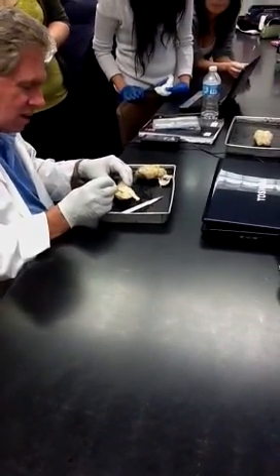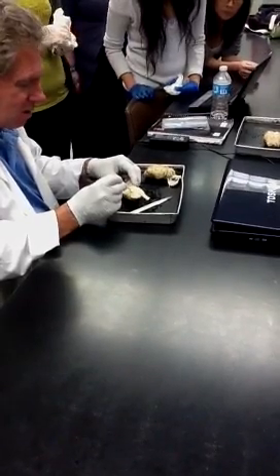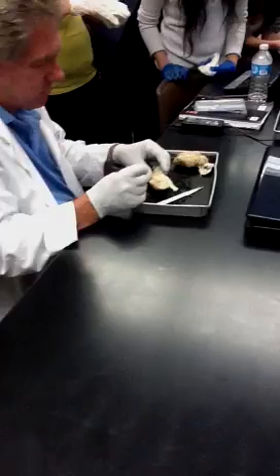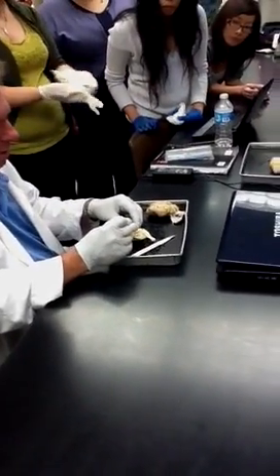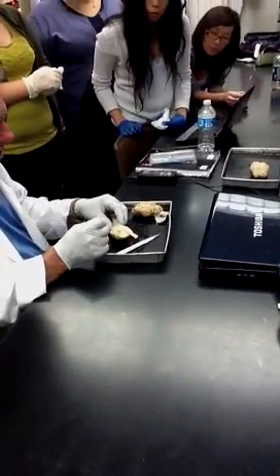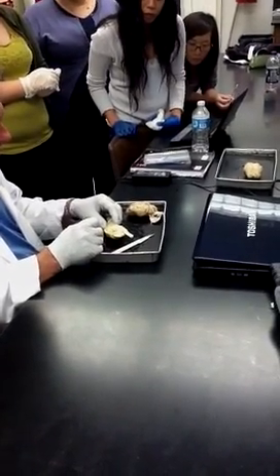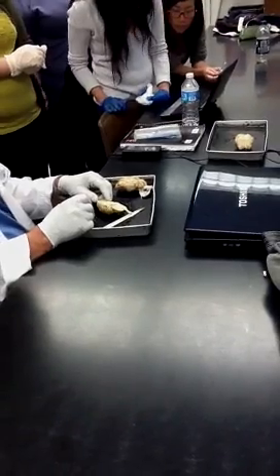The pineal gland isn't cut well on this one. It's kind of cut off. It used to be right there. It's disappeared, but it used to be right there. And that's really about it. This is the pons, the medulla oblongata, spinal cord, lateral ventricles, third ventricle's right here. That's a sheep brain. That's pretty much it.